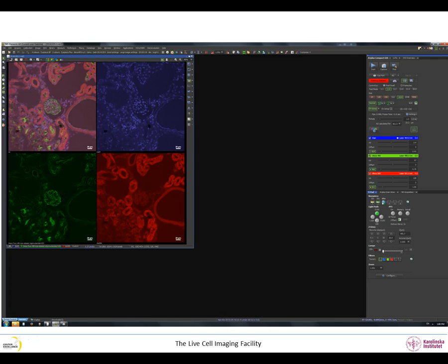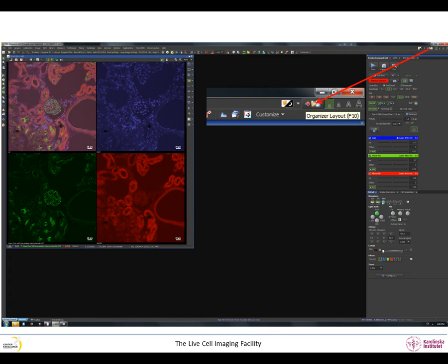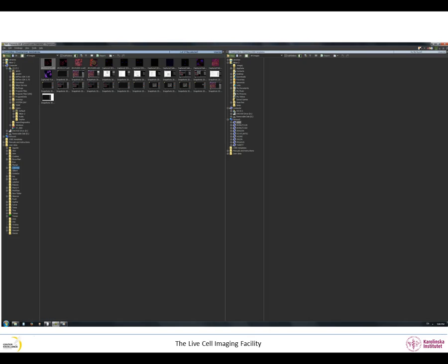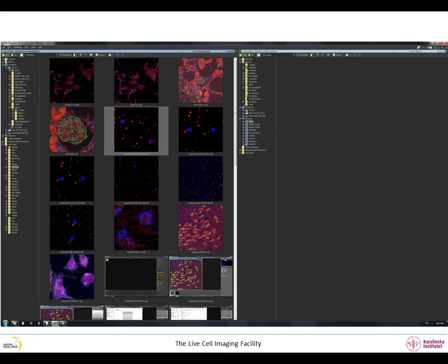The F10 button on your keyboard or this button in the NIS Elements software will allow you to quickly toggle between your normal layout and thumbnails of your saved images in your folder. The size of the thumbnail can be changed. You can have two folders open at the same time, for example, one with your data folder and the other with your external hard disk folder.